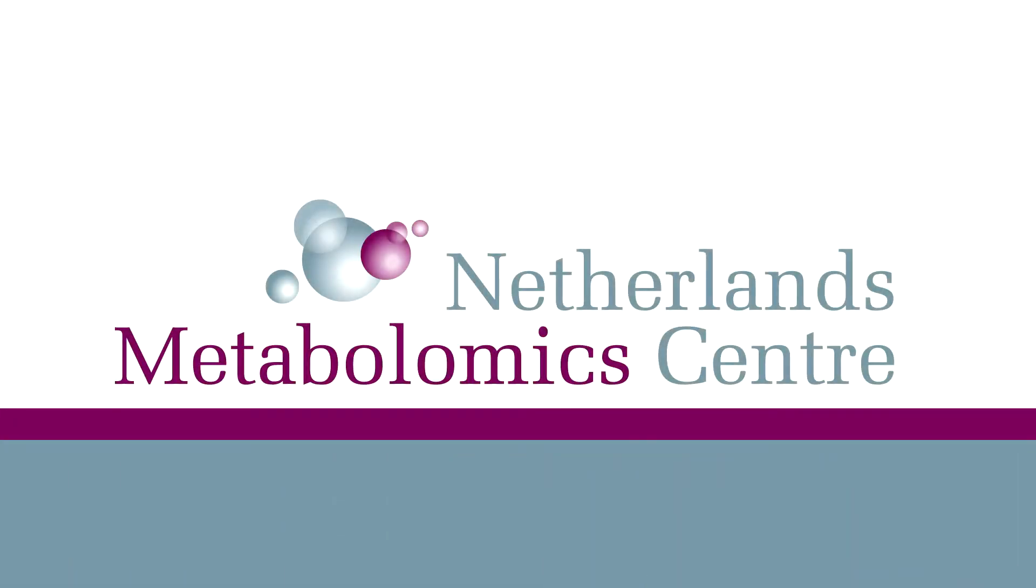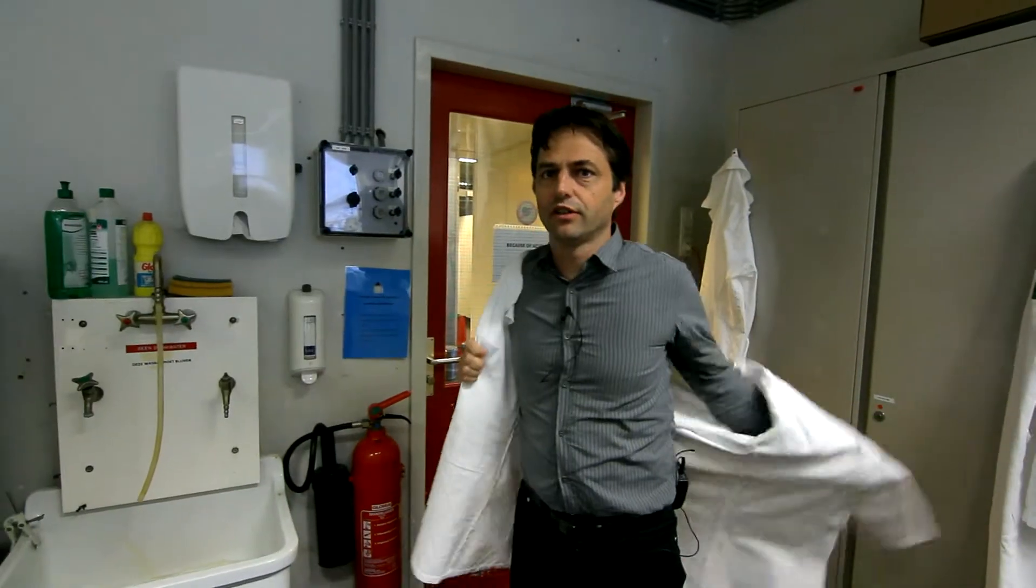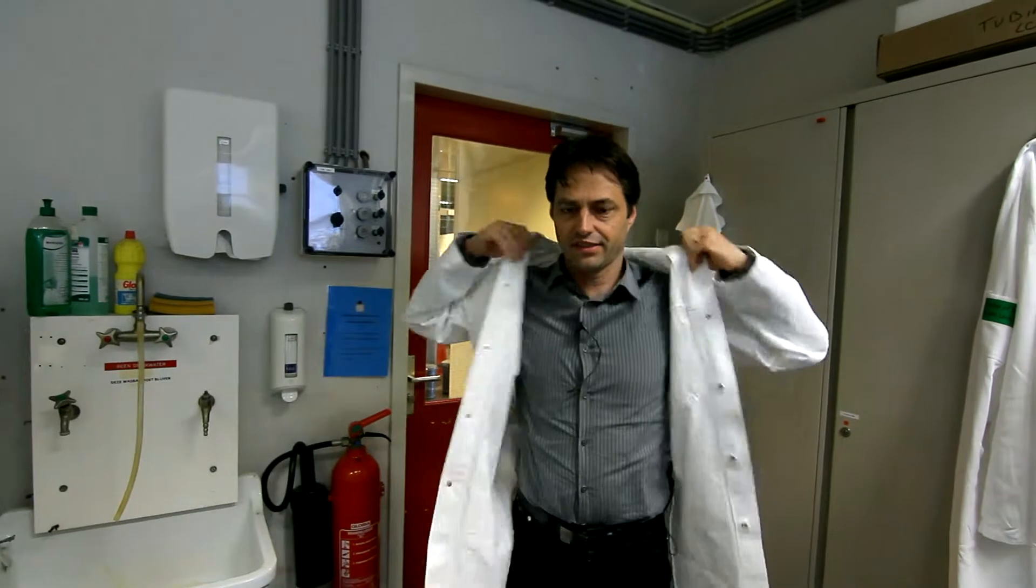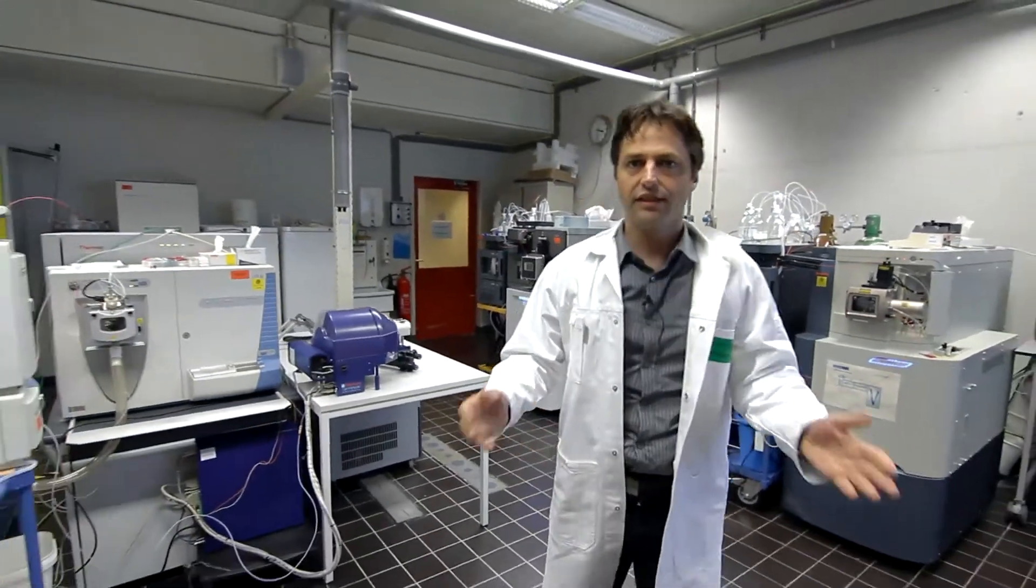This is our metabolomics research lab. In this lab, we developed within the Netherlands Metabolomics Center technologies to measure hundreds and thousands of metabolites, many of them very relevant for vascular disease, targeting biochemical pathways like oxidative and nitrosative stress.